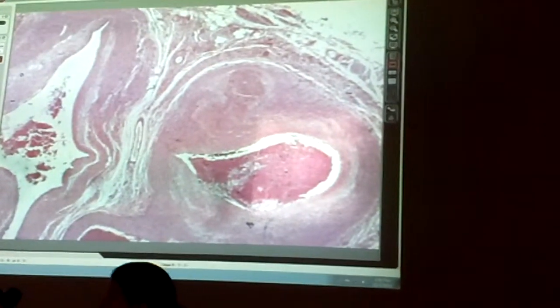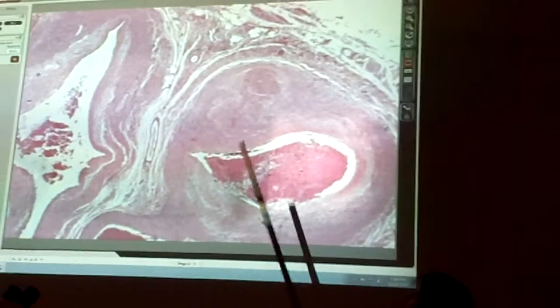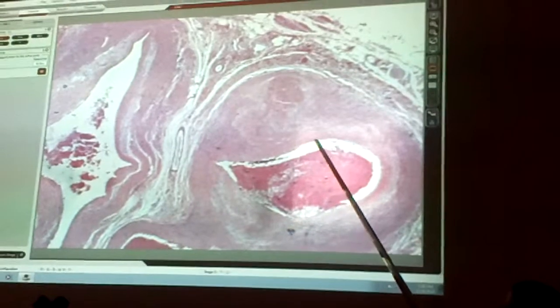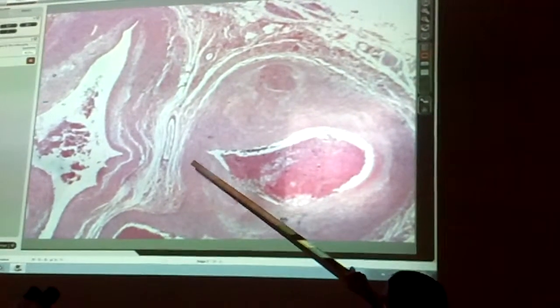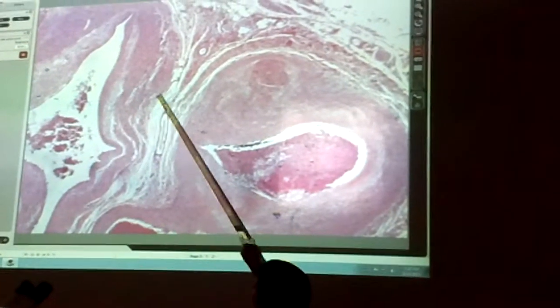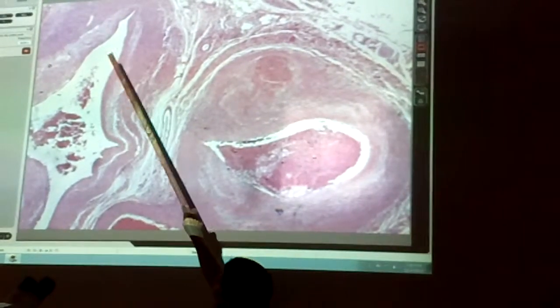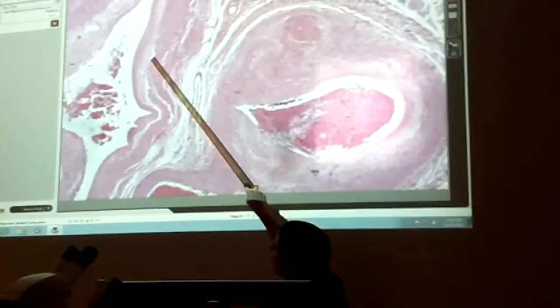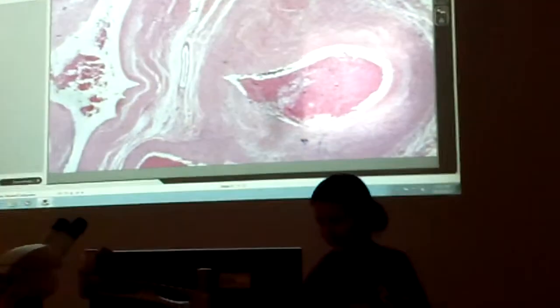The one on the left? On the right? Tunica media. Tunica intima. Tunica externa. So it can be kind of fluffing off the edge of the vessel. Over here, tunica externa. Tunica media. So it's not going to be like point it here and you go, it's going to be very distinct. Yes, purposeful.